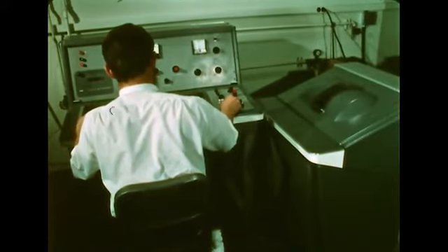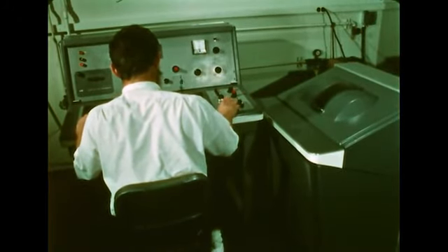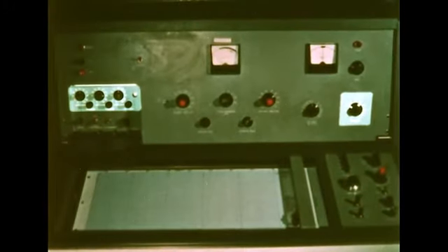Now that we have explained some of the features of an NMR spectrum, let's look at an instrument and see how the spectrum is actually recorded. The NMR spectrometer consists of 2 parts, the console and the magnet. The console contains the recorder on which the spectrum appears and controls for the instrument. The controls are in 5 main groups.